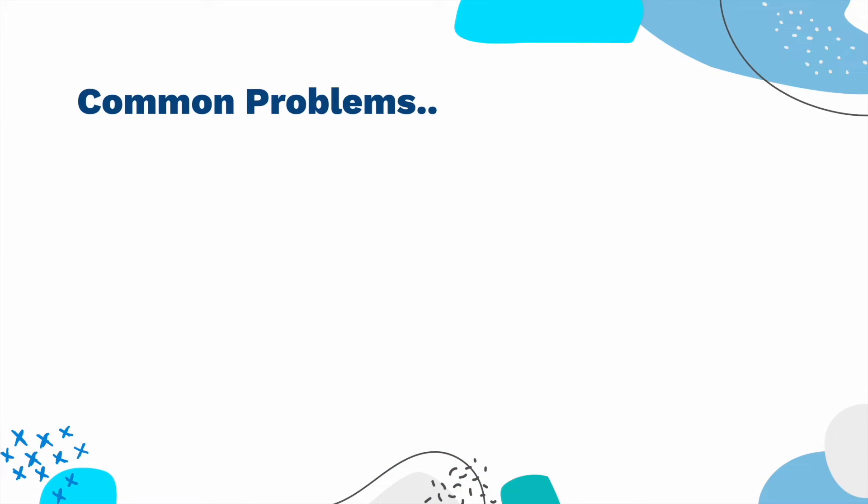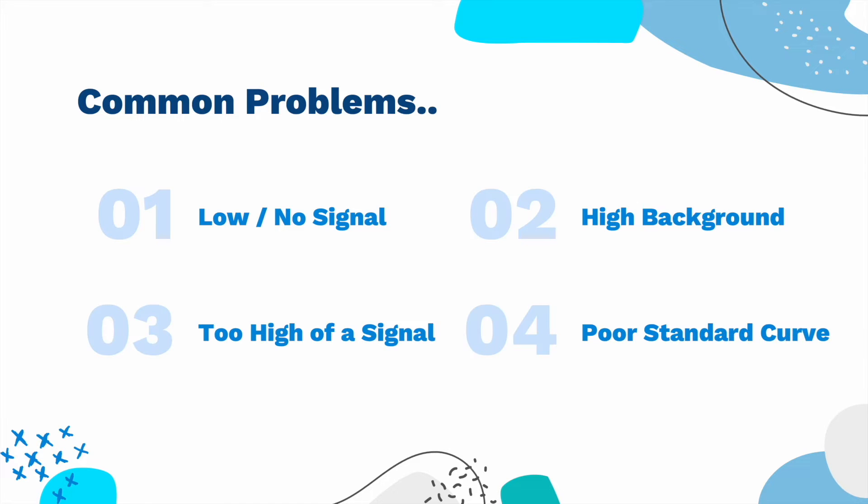Some common problems that you may potentially come across with your ELISA include having a low signal or no signal at all, a high background, too high of a signal, and a poor standard curve.